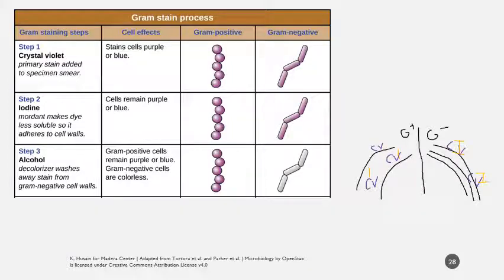So for the gram-negative, where they have this dye just kind of sitting on the top, oops, wasn't supposed to get rid of the membrane, that's going to get removed and it's going to appear colorless. For the gram-positive, you might have a little bit of dye that gets removed, but the dye that got into that structure, the peptidoglycan, is really firmly in place and those cells should remain purple.